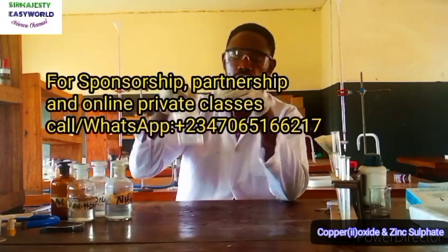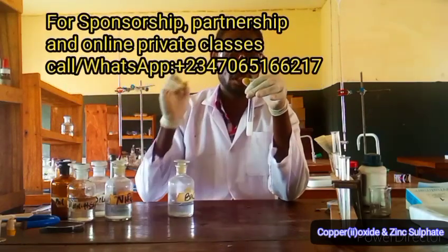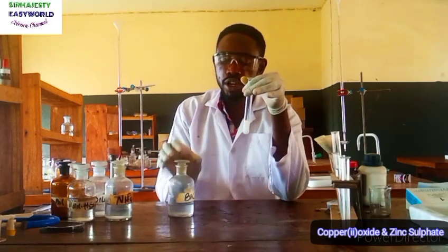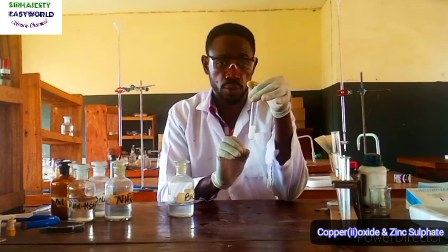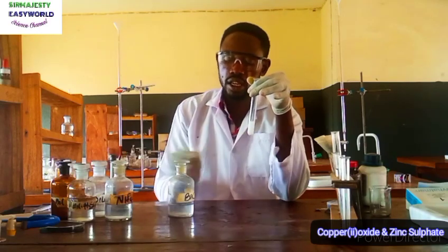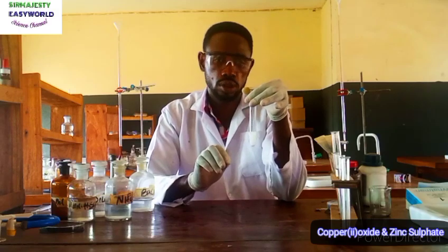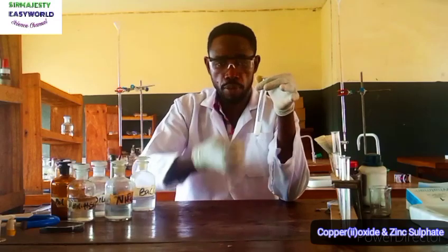This barium here will go in and react with SO4 to form barium sulphate, because barium sulphate is insoluble. If CO3 is here, the barium will react with the CO3 to form barium carbonate, which is also insoluble. If SO3 is here, the barium will react with SO3 by exchange of radicals to form barium trioxosulphate(IV), which is also insoluble. So the idea is trying to check if any of these is there, then you precipitate it out. Now, I've told you in your inference, you suspect SO4^2-, SO3^2-, or CO3^2- if you add barium chloride to any solution of an unknown sample and it gives a white powdery precipitate.